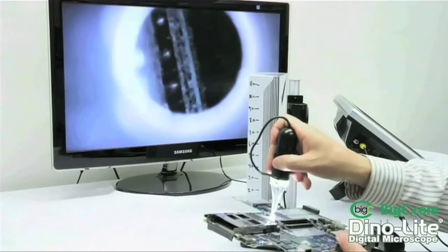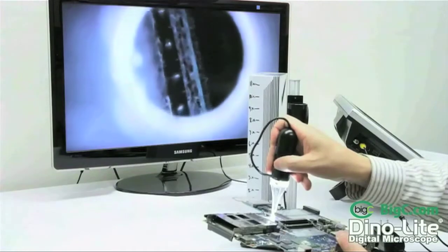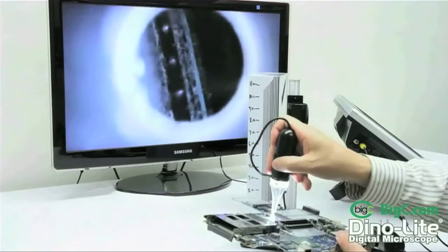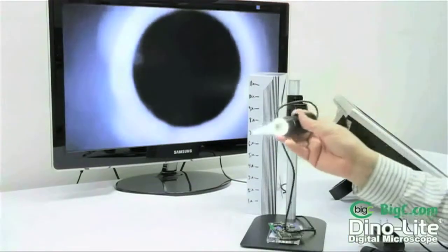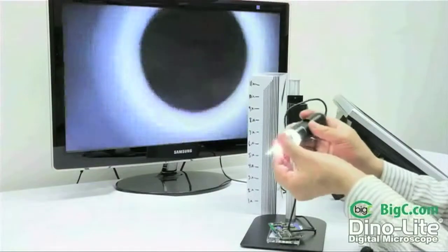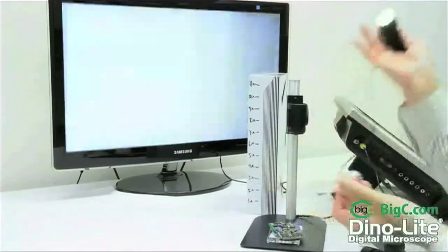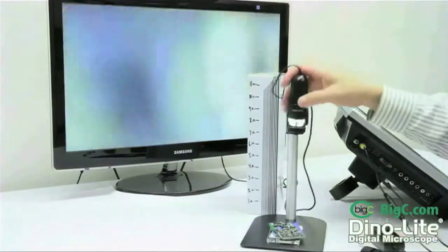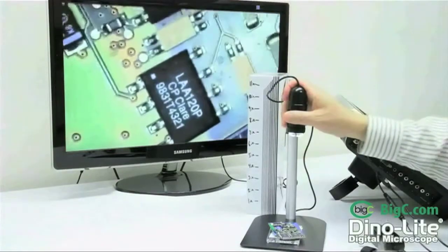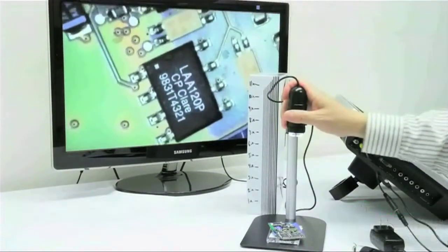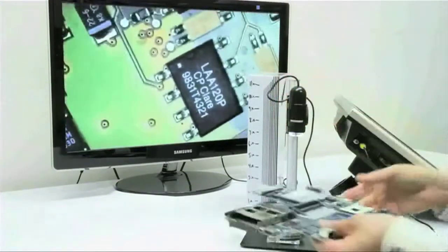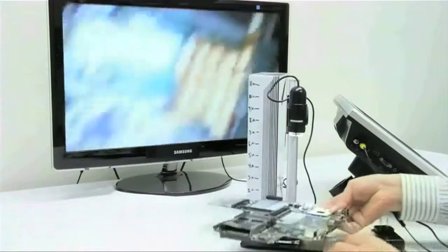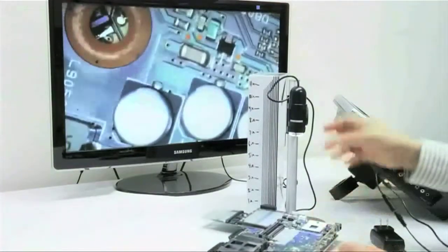In order to remove and or replace a different cap, just align the red triangular markers on both the scope and the cap. Either press in and then or pull out. We do offer a number of different specialized caps for the AD models and you can find those on our website as well.